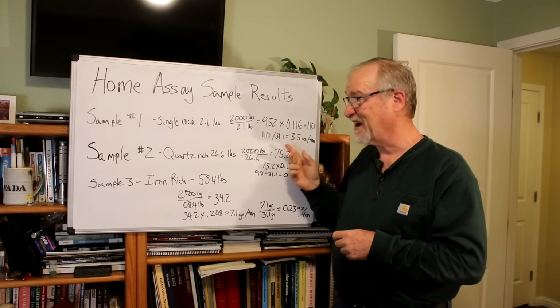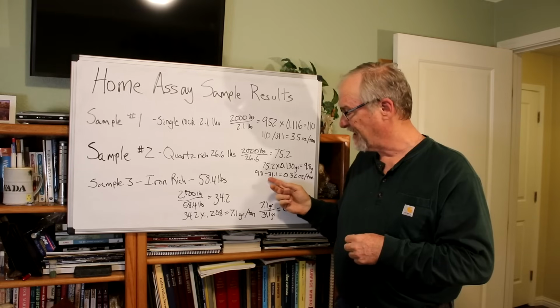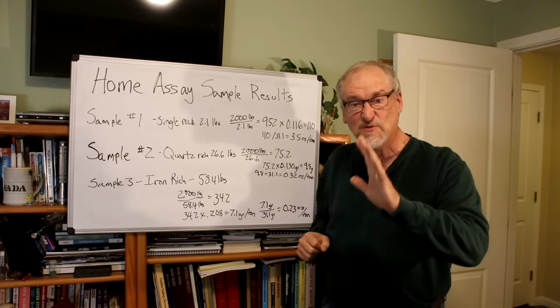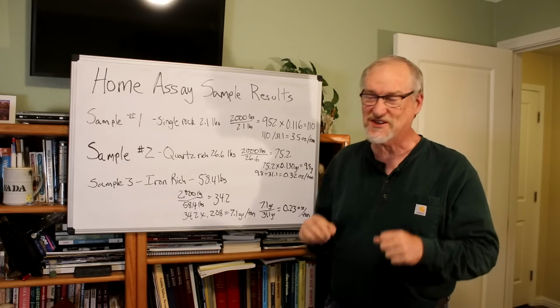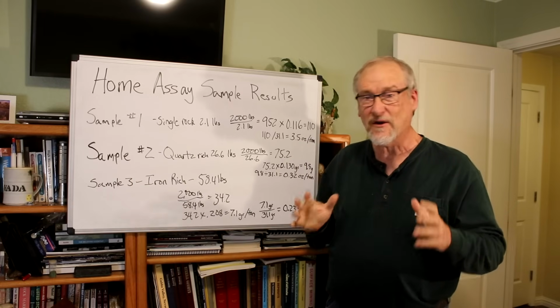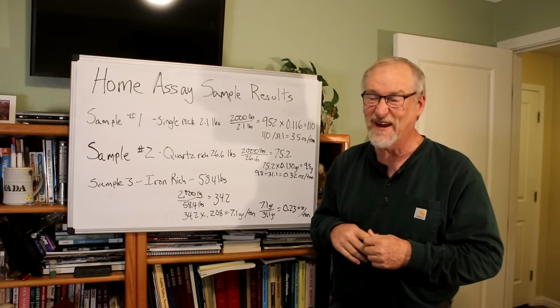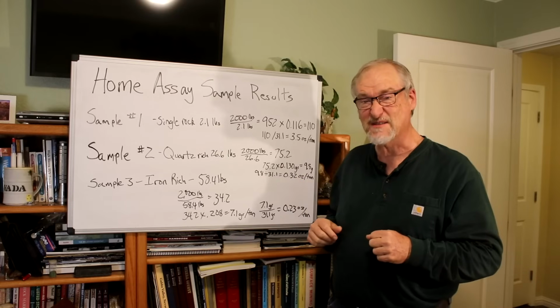But like I say, I only had one 2-pound sample of that. This stuff, I didn't have access to that much more of it than the 26 pounds, and I was kind of disappointed by the 0.32, but that's why you take samples. If you just assume something's rich and then you spend a lot of time and effort processing it, you could be really disappointed. So I processed a smaller amount, got the numbers I need to know, and now I know what that rock kind of runs. About 1/3 of an ounce per ton.